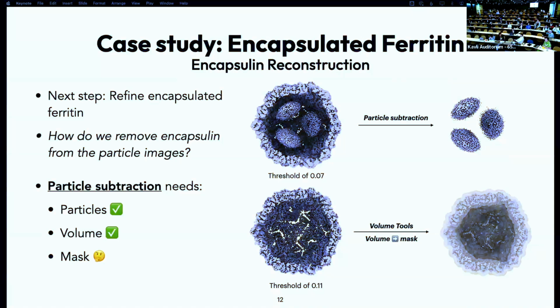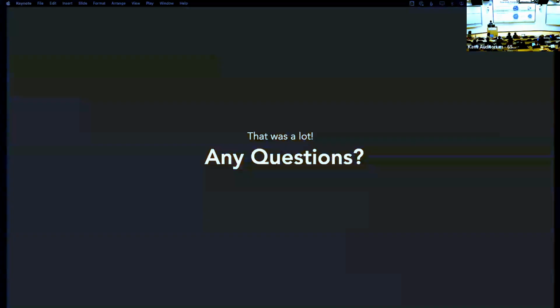Yeah. So I am really not a RELION expert, but I think that they do have a similar local symmetry thing where you can specify a set of transformations like rotation matrices and shift vectors to align different subunits. That is pretty much exactly what I'm doing here, in this step here.